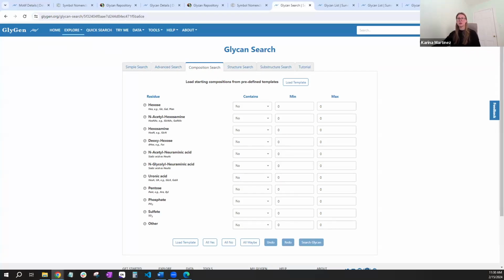So exercise 2, our task is to find the GlyTouCan accession for the composition string HexNAc2, Hex2, dHex2, and identify the fully defined structures with this composition in mouse. So this is sort of a two-pronged search. First, we want to find the GlyTouCan accession for this base composition glycan. If you're running a mass spec experiment and you get a composition string, you know the composition, you can just enter that in here.